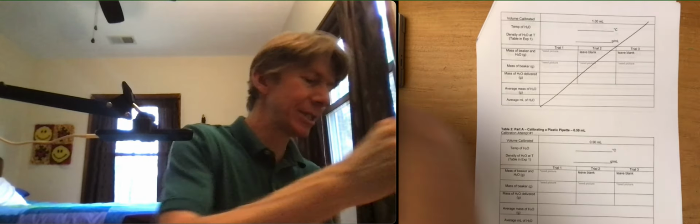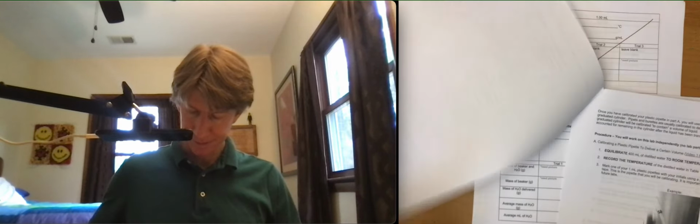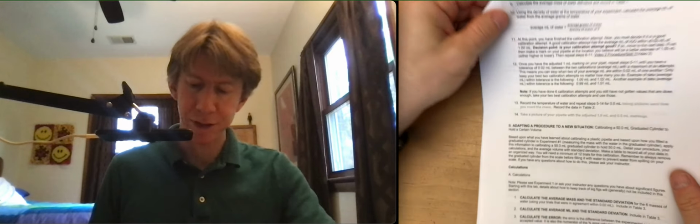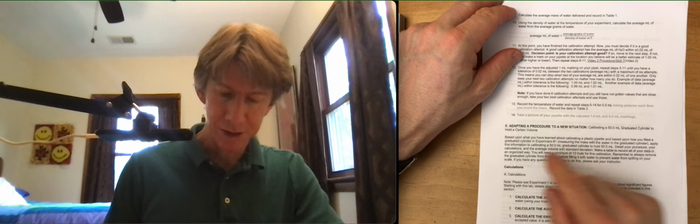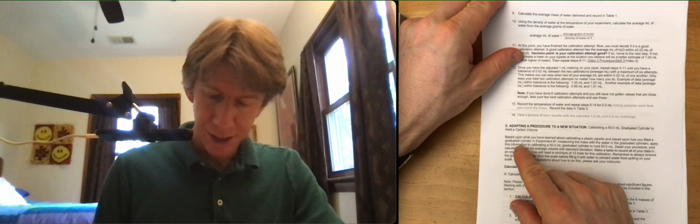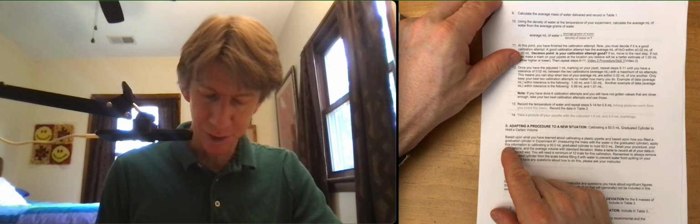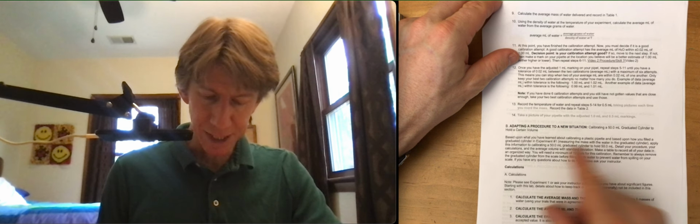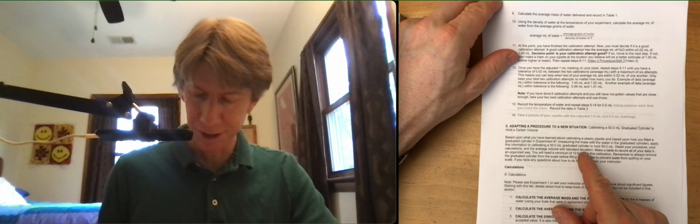Now, as far as the graduated cylinder, if you look at the procedure, it says adapting a procedure to a new situation, calibrating a 50 milliliter graduated cylinder to hold a certain volume. Based upon what you learned about calibrating a plastic pipette and based upon how you filled a graduated cylinder in experiment one, apply this information to calibrating a 50 milliliter graduated cylinder to hold 50 milliliters.